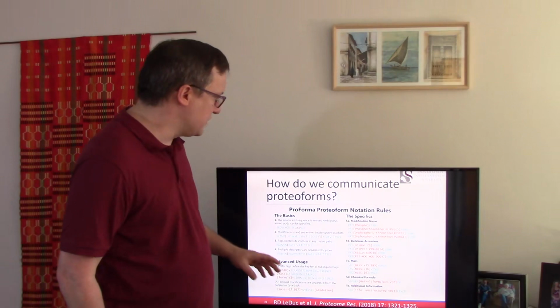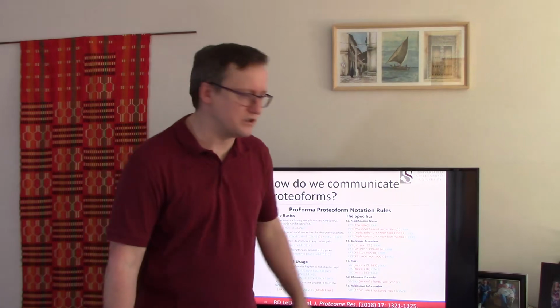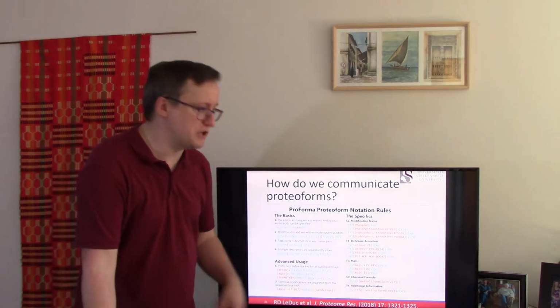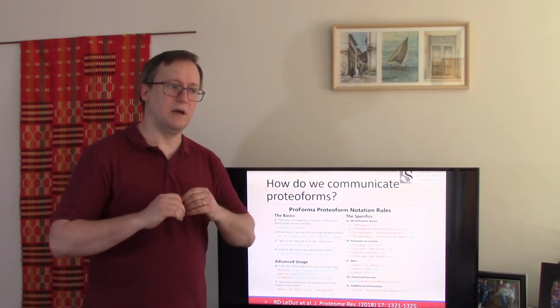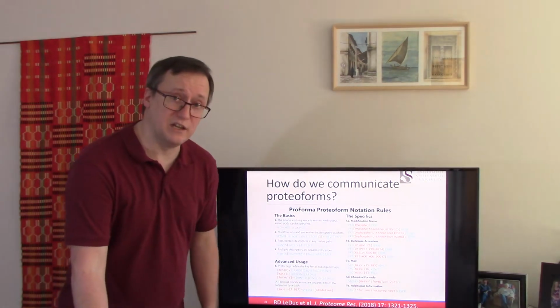Now for this last part, I want to spend a little time coming to some slides that were provided by my friend Richard Leduc up at Northwestern University. If you have a profusion of new tools in a space, it's not very helpful if each of them have a completely different format for describing which PRSMs they have observed, which proteoforms they have observed. So the group that Richard Leduc has headed has created this approach called ProForma, which represents a way to communicate to others in the press a standard set of proteoform definitions that relate to the data at hand.